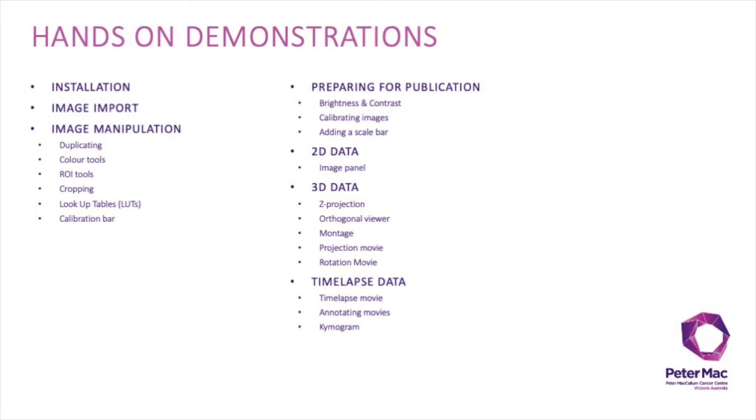In session 1 of the Fiji for Beginners workshop, we are going to cover installation of Fiji, how to import images into and also manipulate images within Fiji. This includes duplicating, splitting and merging colors, using region of interest tools, and cropping images in preparation for figures.